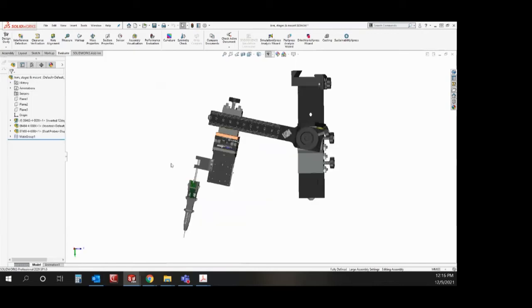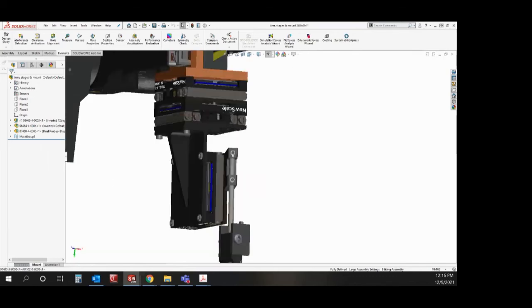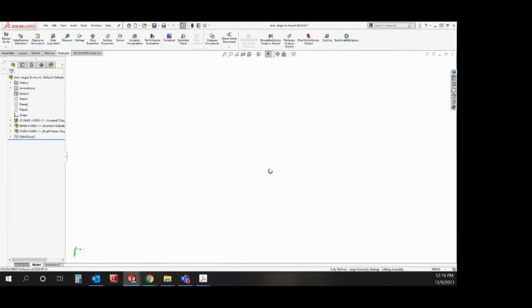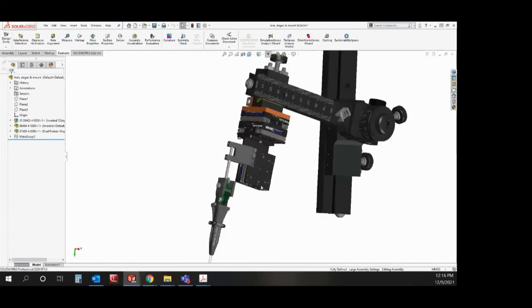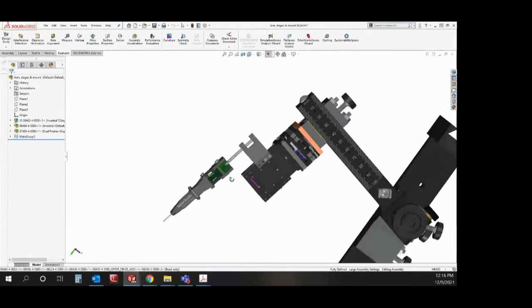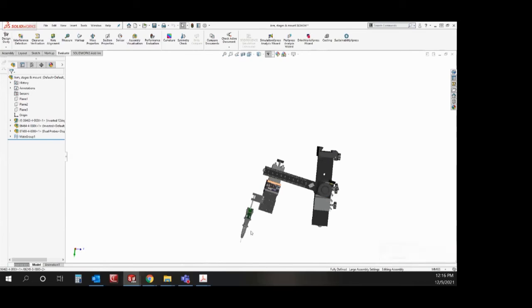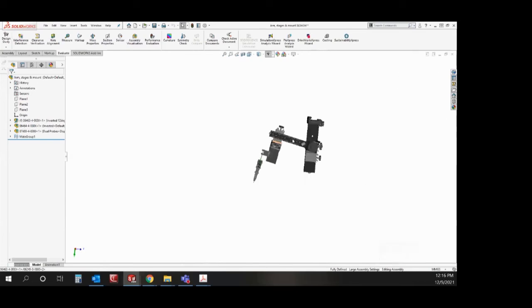Once you have everything installed, two screws to install the base onto the stage. And there are two set screws at the top. So you can slide the rod in, tighten the set screws, adjust your length accordingly for your needs. As mentioned, this will only work with probes that do not have a dovetail cap installed.